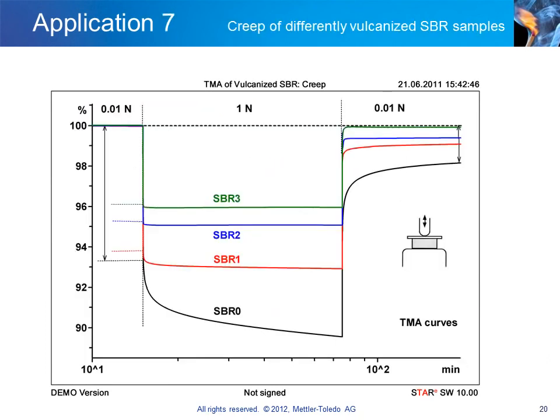The most important properties of elastomers used for sealing applications are the elastic modulus and the creep and viscous flow behavior. Creep refers to the time and temperature-dependent elastic and plastic deformation of a material when it is subjected to a load or stress.